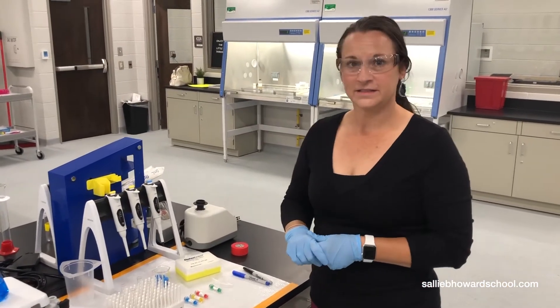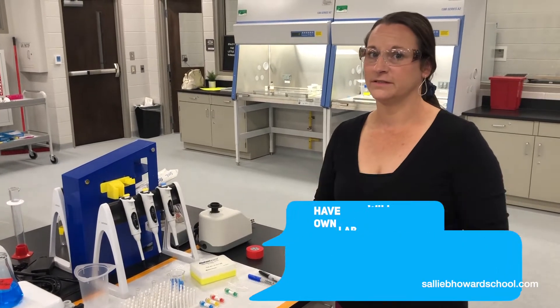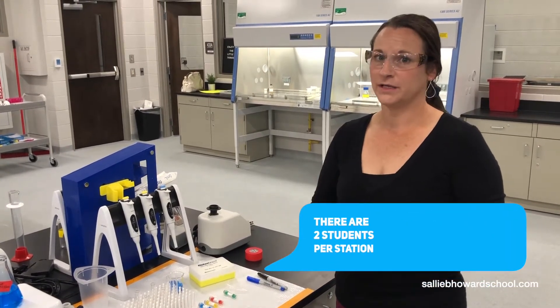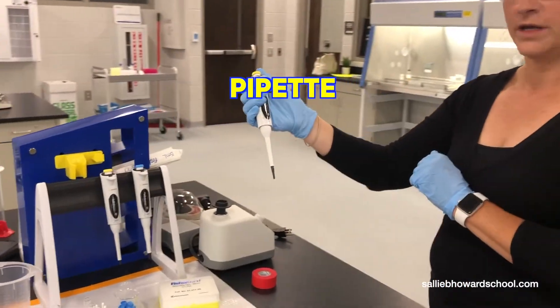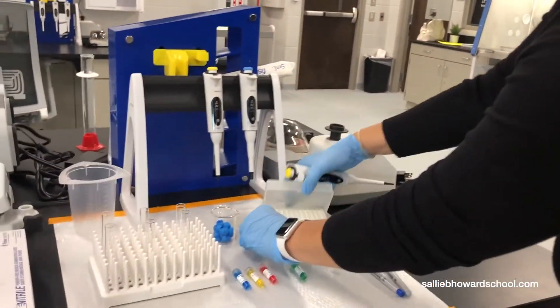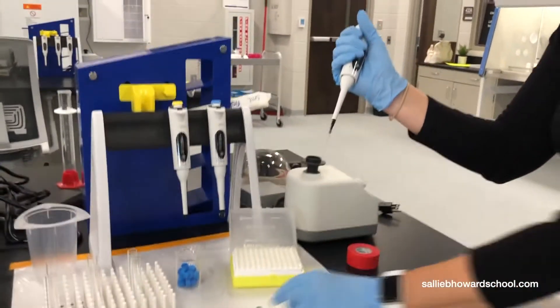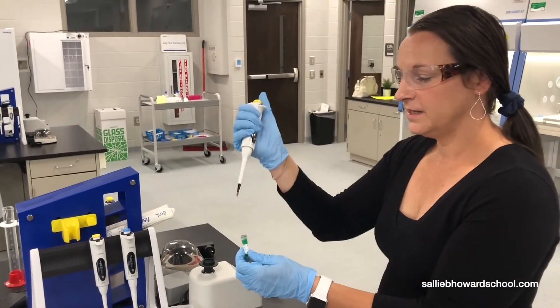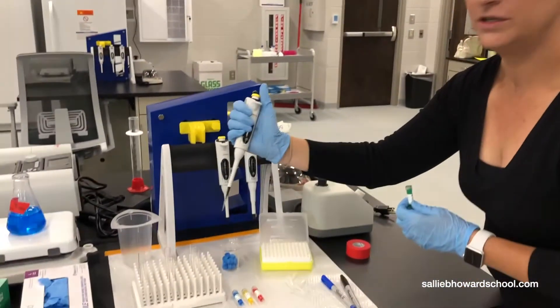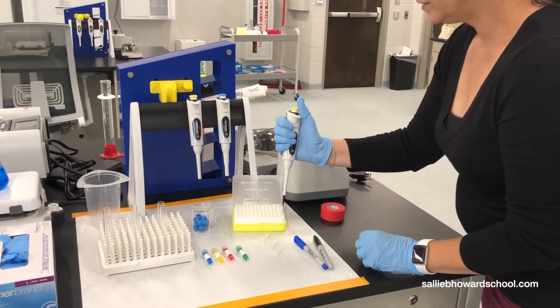Our young scientists will have their own lab space, and maybe they're going to work on pipetting skills — a key component to being a good lab tech. They would grab their pipet of choice for what they're working with today, open their box of tips, put a tip on, grab their aliquot of whatever they're working with, take a sample, and put it in their test tube.